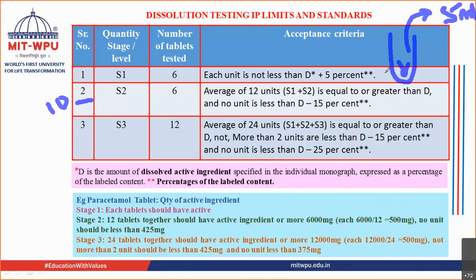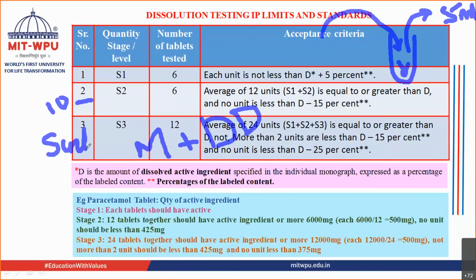Now after removing 5 ml of the sample, which contains medium plus the dissolved drug, what you now do is you again put 5 ml of only the medium inside it, right? So आपने 5 ml निकाल लिया था मीडियम, आपने 5 ml वापस उसमें मीडियम डाल दिया. This is known as maintaining of sink condition. This is how you maintain the sink condition.